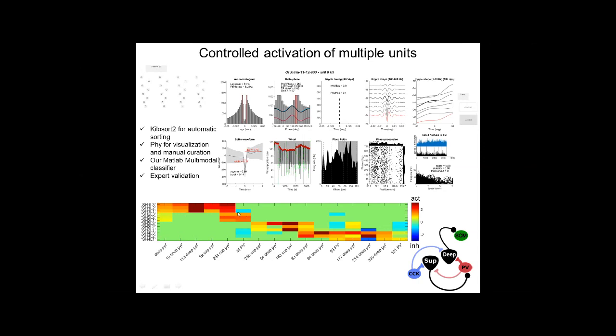But you also see that there are interactions, and there is poor interaction between the channels as you move across them. Using this information, we can map the circuit more specifically and try to identify the specific connectivity between deep and superficial cells with different types of interneurons.